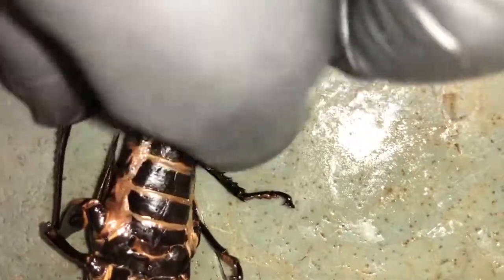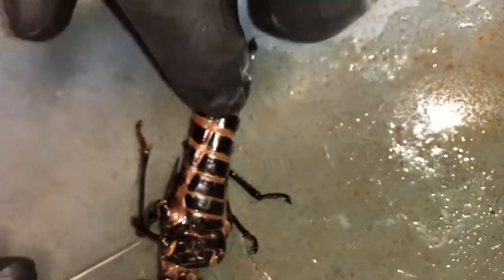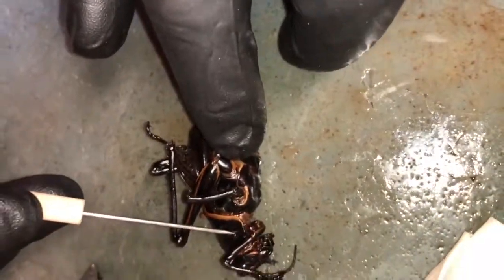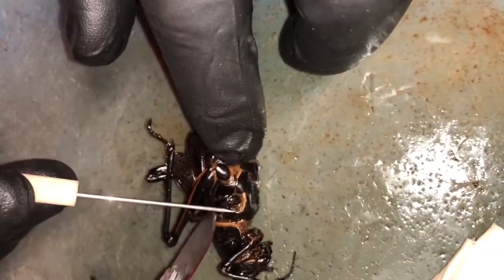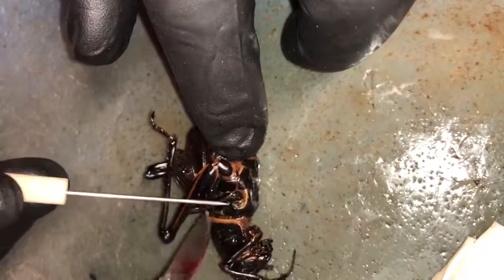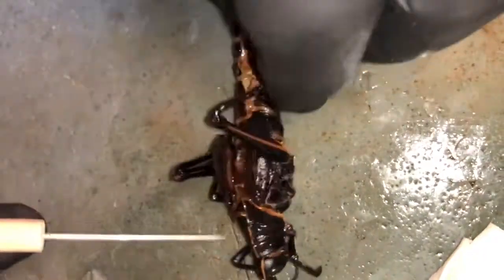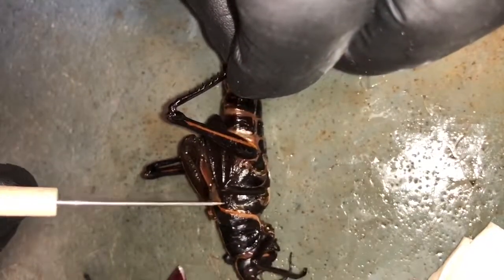Can you show me the abdomen? This whole area. Okay. Can you show me the tergum, right there? Prothorax. Prothorax, mesothorax, please. Mesothorax here. And the metathorax. Forewing, please. Forewing right here. Can you flip it forward?